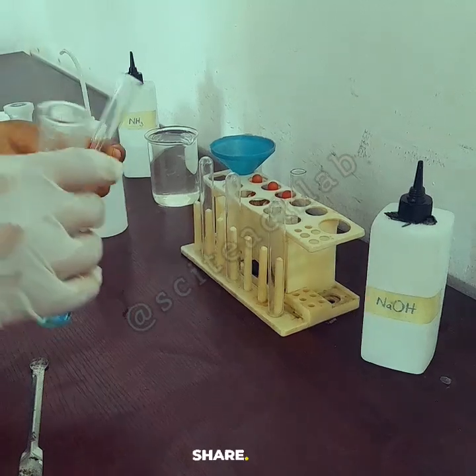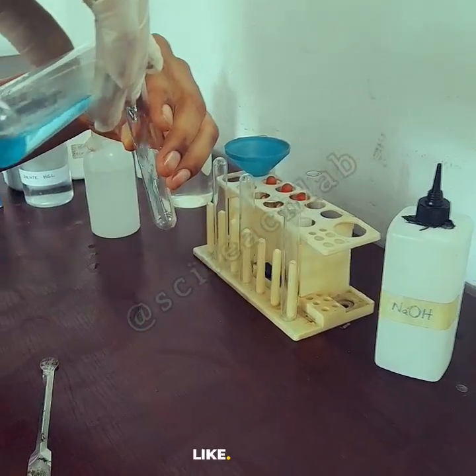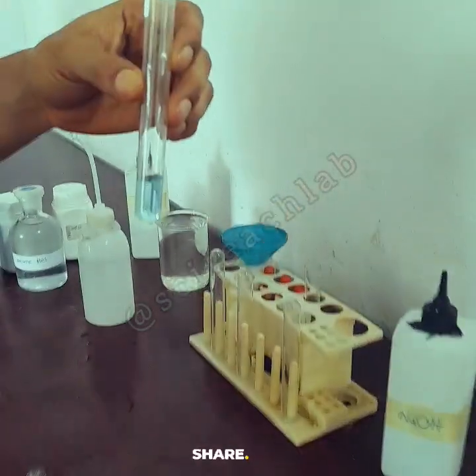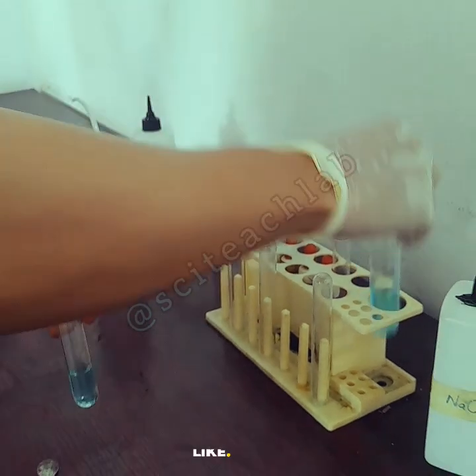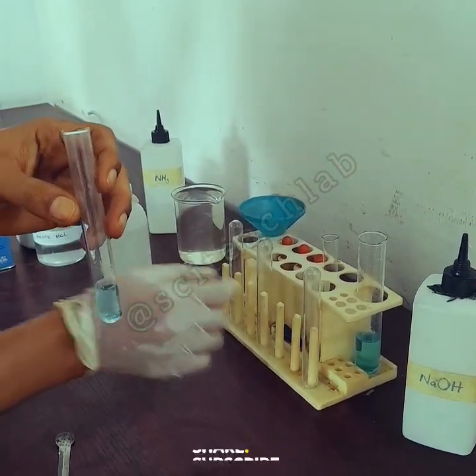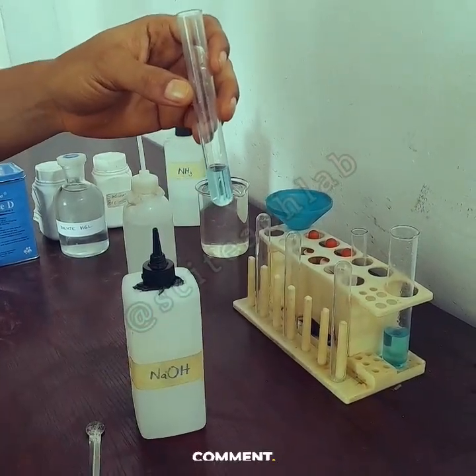So I pour a little amount of the solution of C into another test tube where I will carry out the first test. So C is in the smaller test tube, and I'm going to start my test.